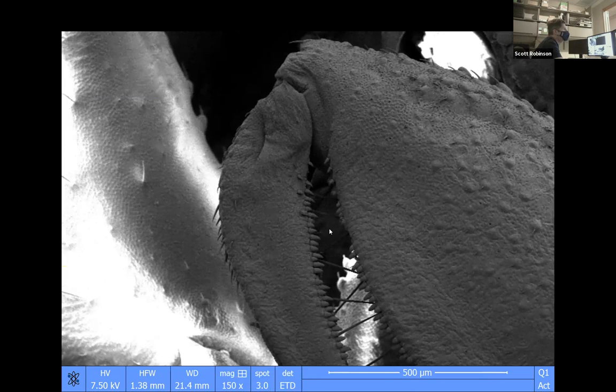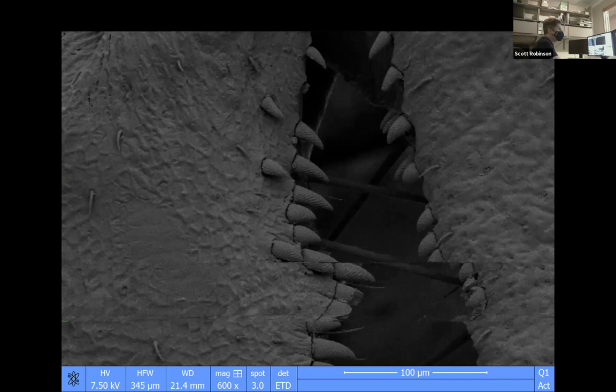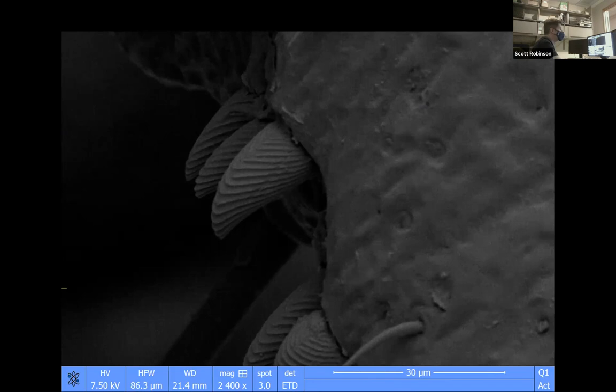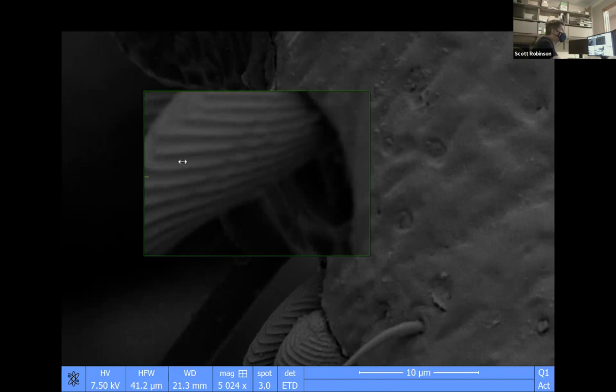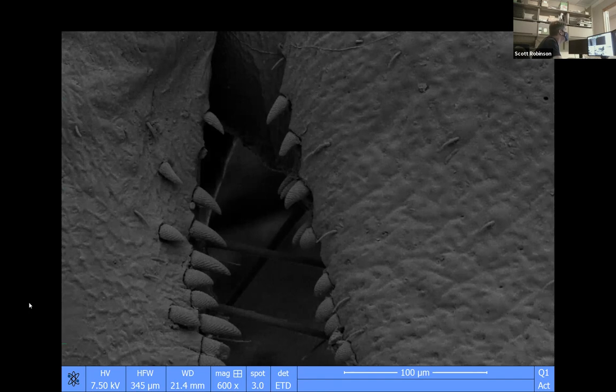If the ambush bug attacks you, it's going to grab you with these pincer-like arms, and these little sharp things that are really beautiful right here are what holds on to you really tight. Praying mantises have something like this. You can see how they would hold really well. Yeah, and it's quite impressive when you see it.